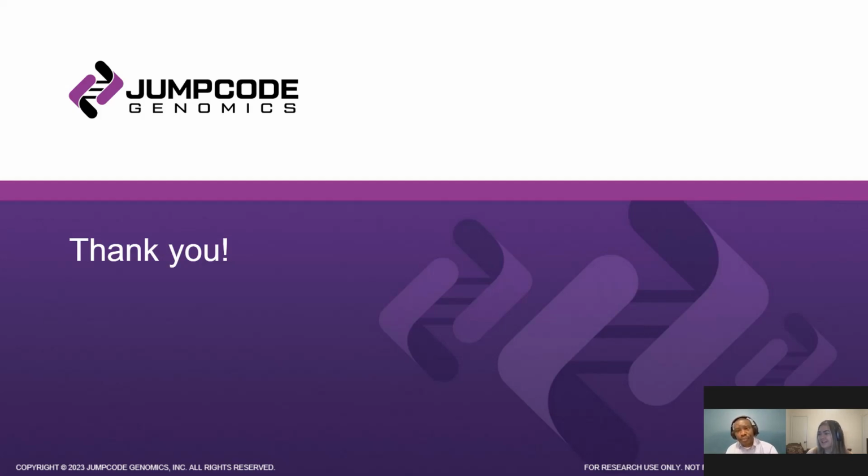Wonderful, thank you. Next question asks, does this depletion strategy bias toward gram-positive or gram-negative bacteria? Very good question. We do not observe any obvious bias. From the presentation, you saw that the Zymo microbial community we were looking at has different GC content, and has gram-positive and gram-negative microbes in there, and we did not see any bias in the boosting of each of those microbes.